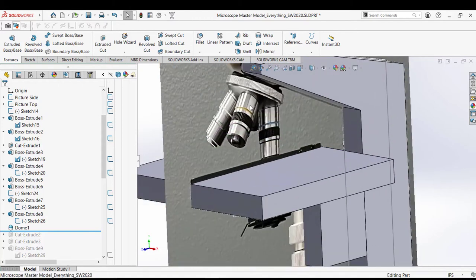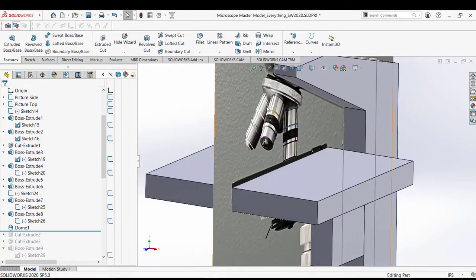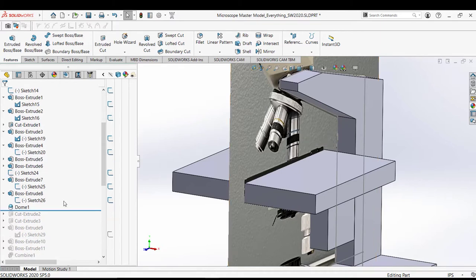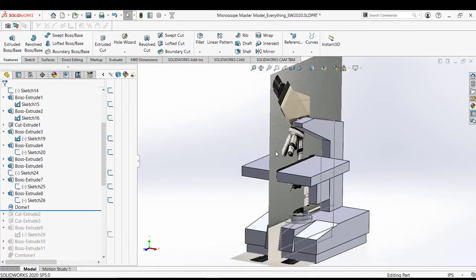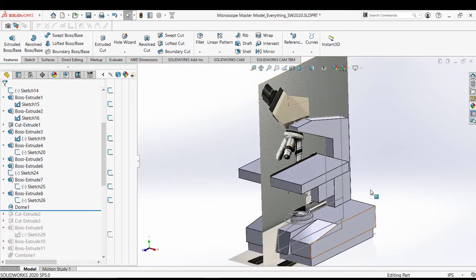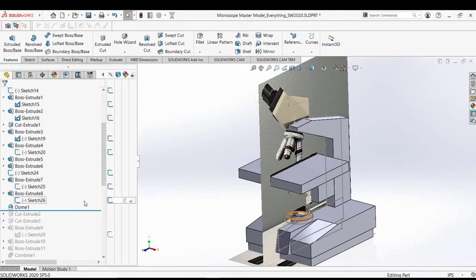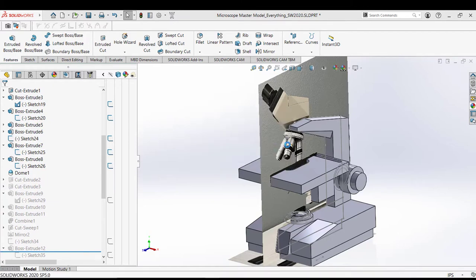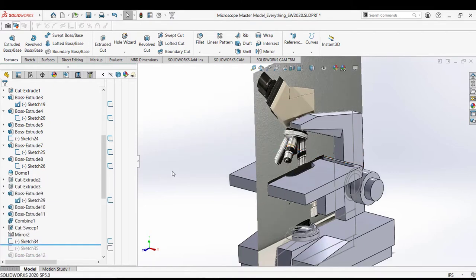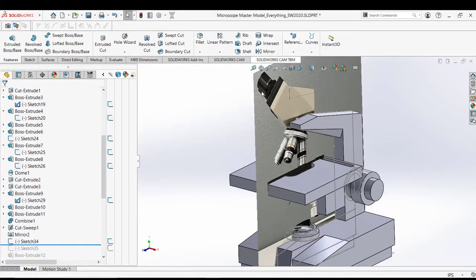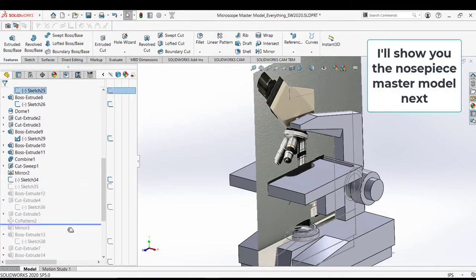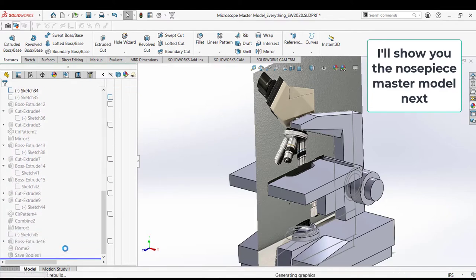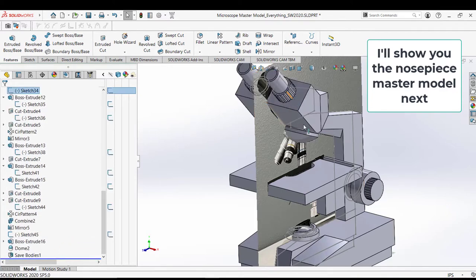But where the tolerances did matter, where the precision did matter, is the actual mechanism that we were studying. So my process, my logic was, okay, let me make a microscope. Something that's visually appealing for the thumbnail and for everyone watching. But really I'm going to focus on this nose piece. And that's why I decided to create a separate master model for the nose piece. And then I would import them both.